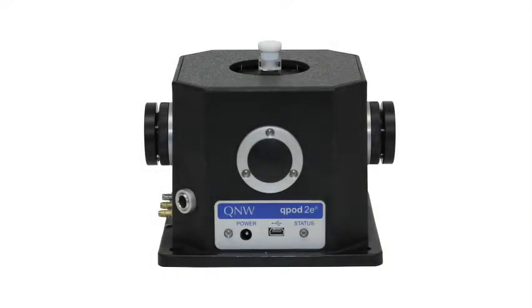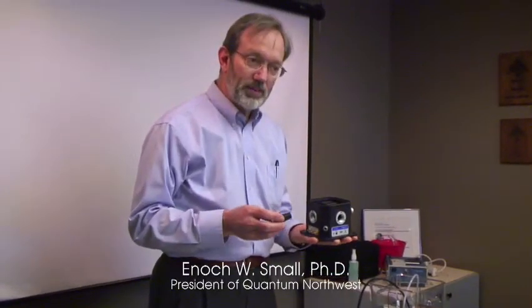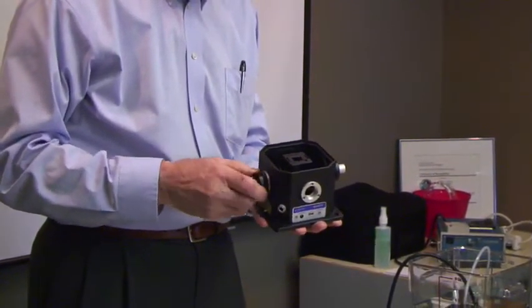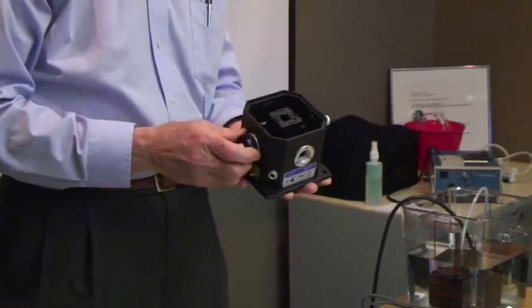The Q-Pod is a cuvette holder. You put a cuvette in here and you have a series of different kinds of lenses. The very nature of the device allows you to do temperature control so that there are temperature changes occurring, and the optics are held in a very stable manner.